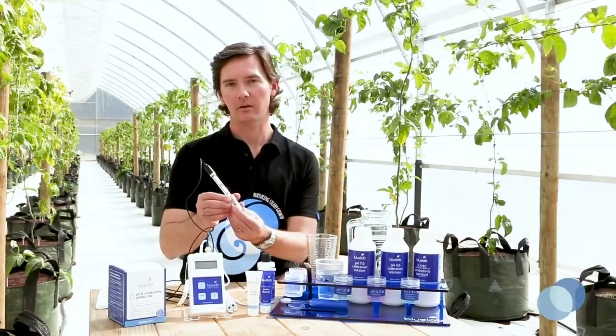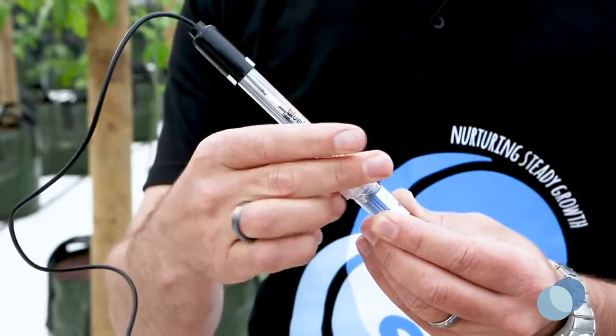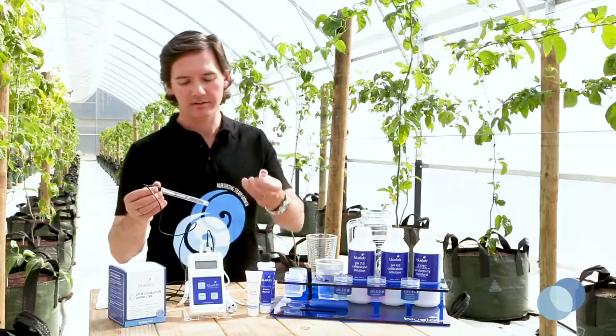First, turn the top of the storage cap counterclockwise to loosen it. Remove the storage cap and place it upright.